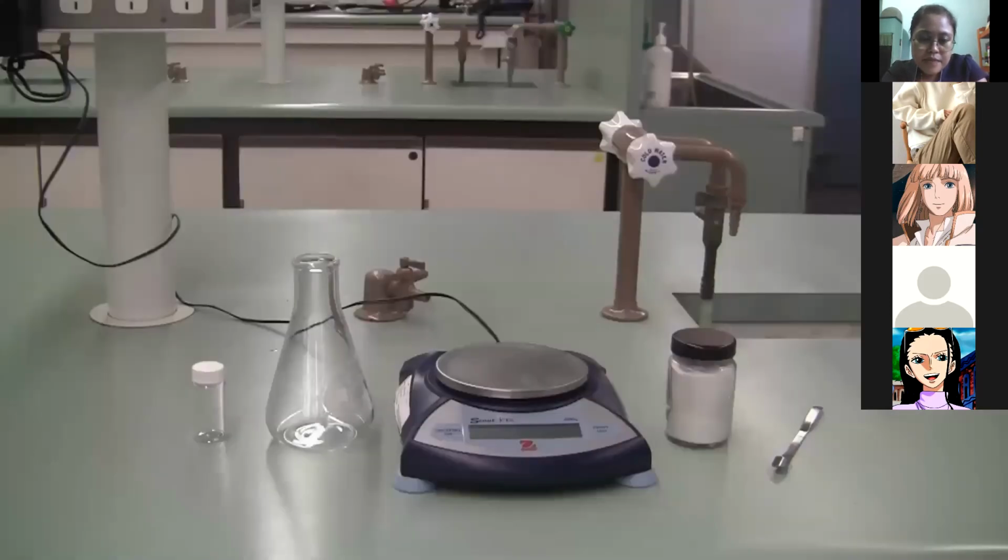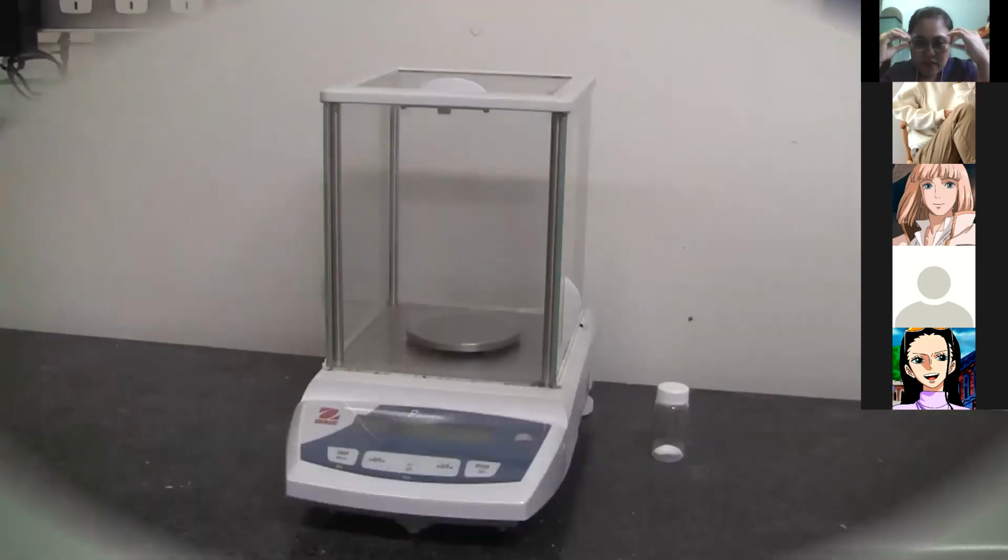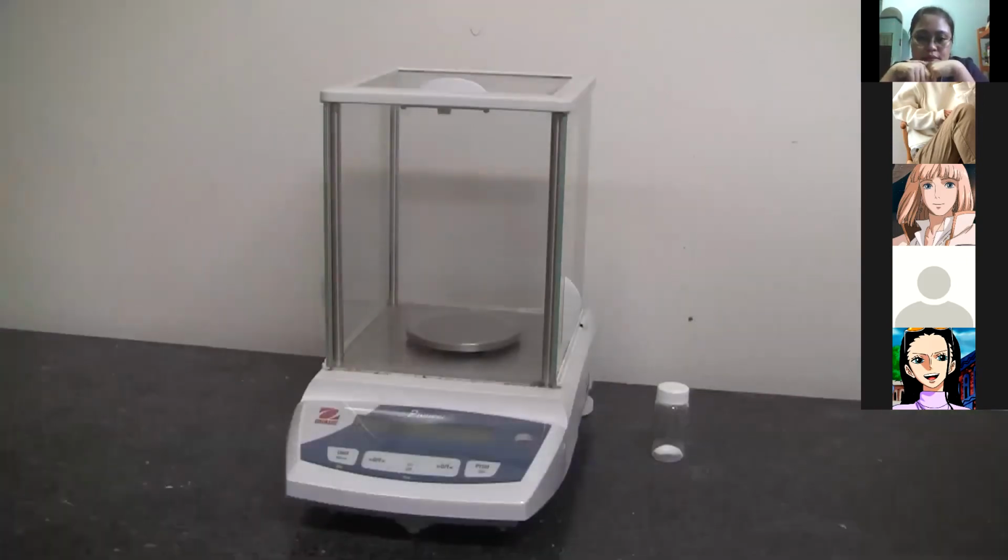Right, in this video we're going to learn how to weigh by difference, and we're going to do that using the top loading balance here and the analytical balance here too.